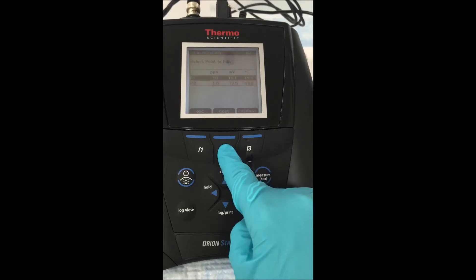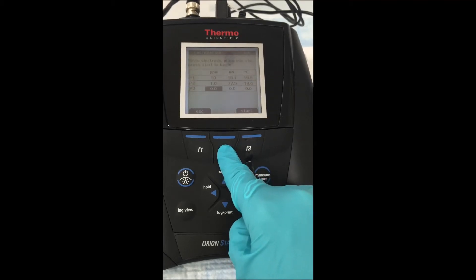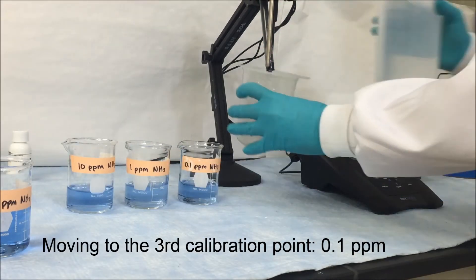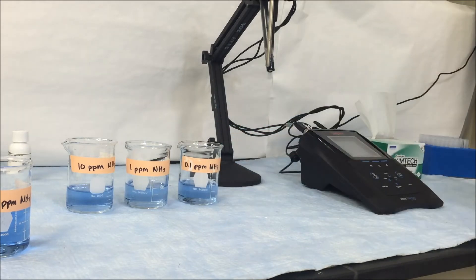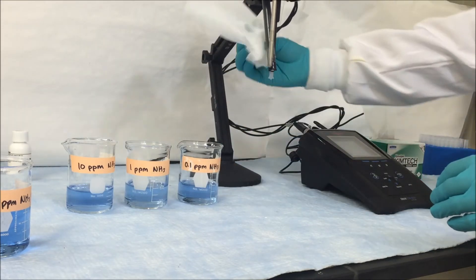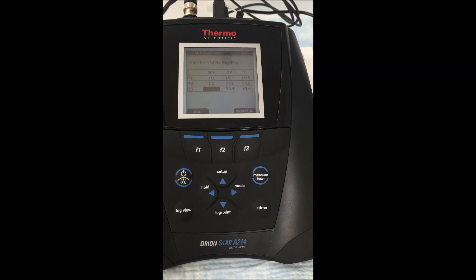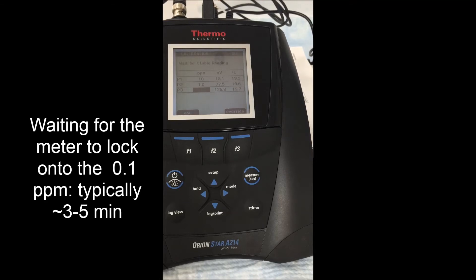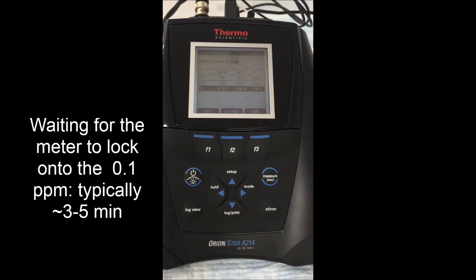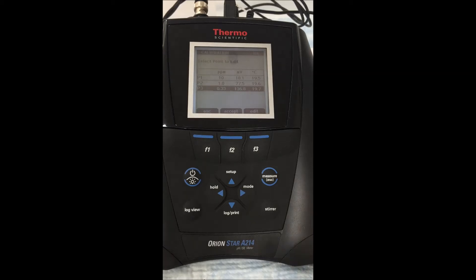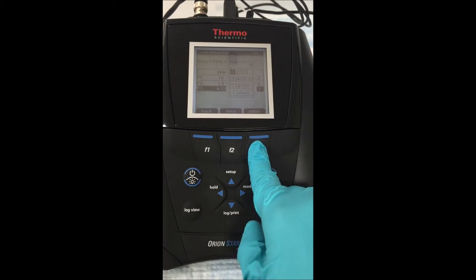We're going to remove our electrode from that 1 part per million solution. Again, making sure to rinse it thoroughly with deionized water to get all the old calibration standard off. We're going to place it into our lowest level standard. Generally speaking, when going into the last calibration point at a very low concentration, this reading may take a little bit longer. Generally about 3 to 5 minutes later, the meter is going to lock on to a value at which we're going to then again go in and edit it to say that it's 0.1 parts per million.